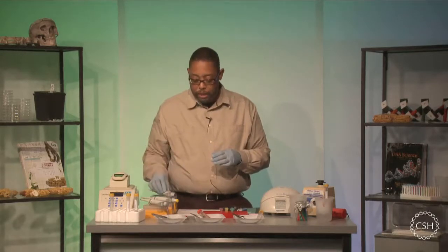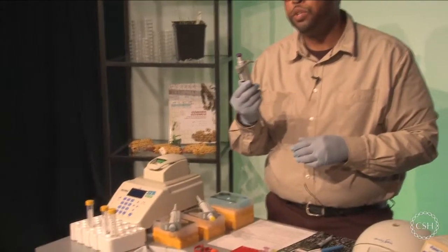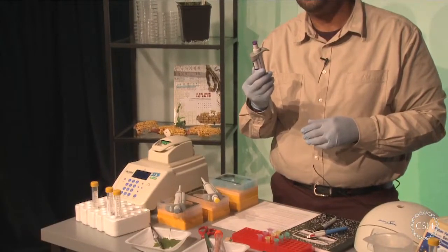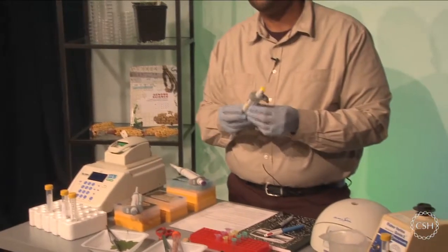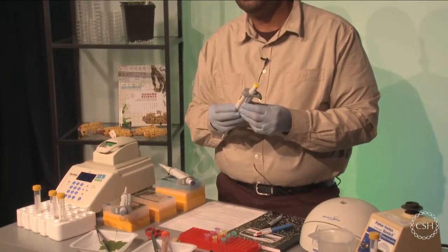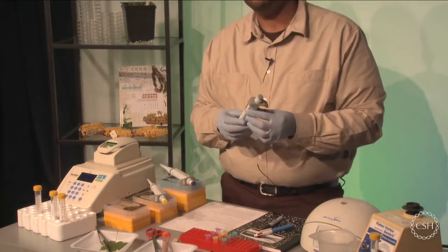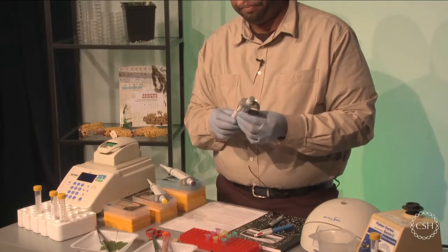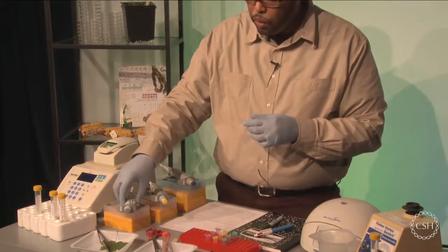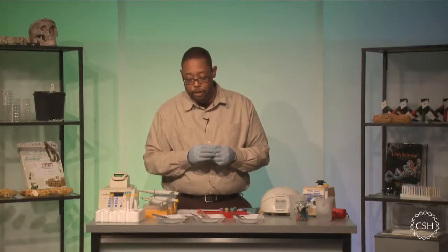Now, hard equipment, we're going to need some pipettes. We should have a P1000, which will go from 100 to 1,000 microliters. We are going to need a P100, which is going to go from 10 to 100 microliters. And we're going to need a P10, which is going to go from 0.5 microliters to 10. If you notice, I also have the tips that correlate to each pipette as well. So make sure you have that available to you.